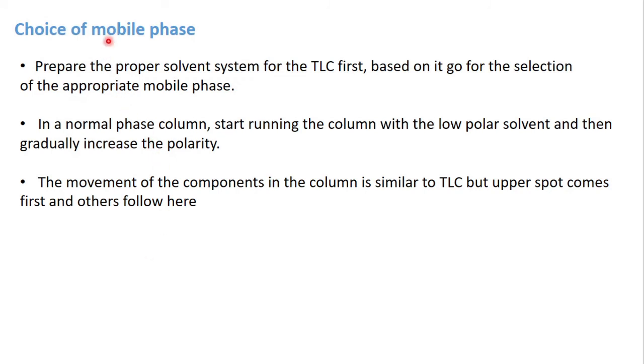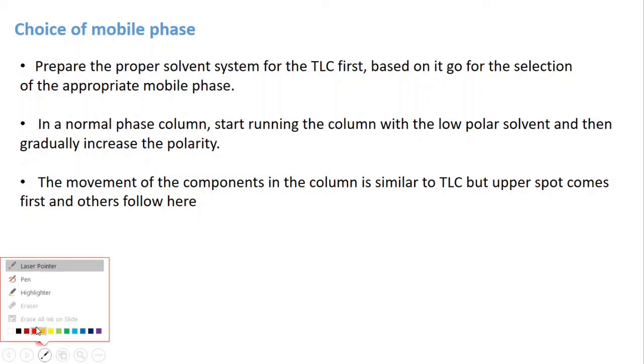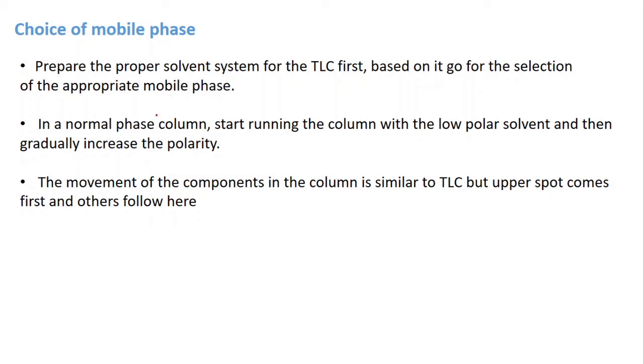And choice of mobile phase. This is very important before running the column. What kind of mobile phase you are going to use? So you should set up the mobile phase based on TLC. Before running any column, you should run the TLC first.